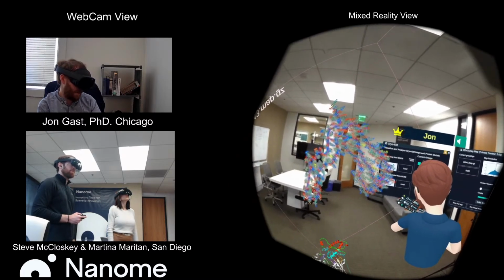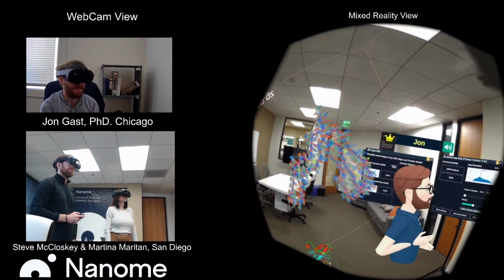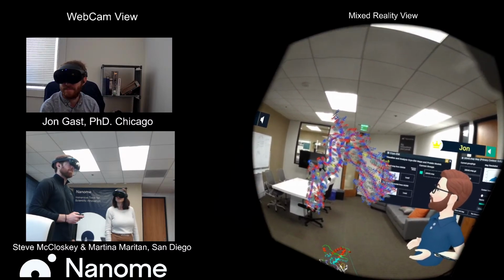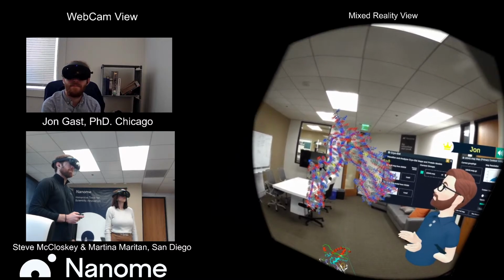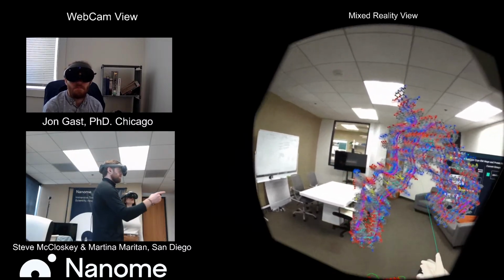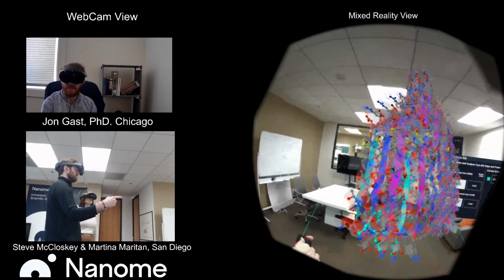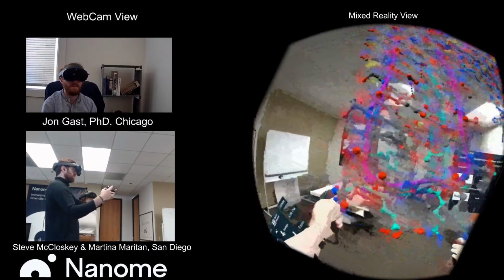We're getting a bunch of questions here, so trying to tackle as many as we can. Another question is, can you explain what the cryo-EM plugin does more specifically, as opposed to opening the structure just like any other protein structure without this plugin? Most protein structures without this plugin would just be the ribbons and the ball and stick structure, and then you could generate a computational surface.